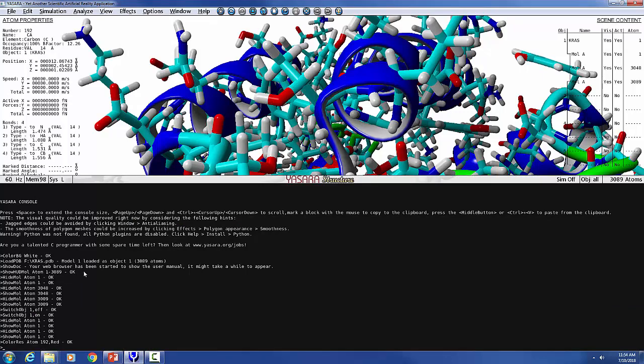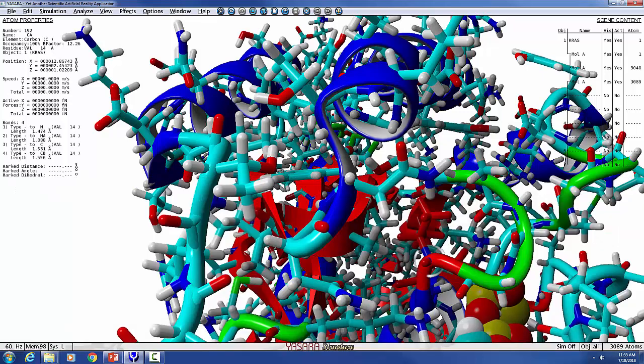If you are particularly good at programming, you can double click the space bar and you have the code that's involved with all the different commands that you have. So if you want to incorporate your own code, then you can use it that way. And as a side note, a lot of what I'm talking about here is indicated in the condensed code slides PowerPoint that I have already sent you.